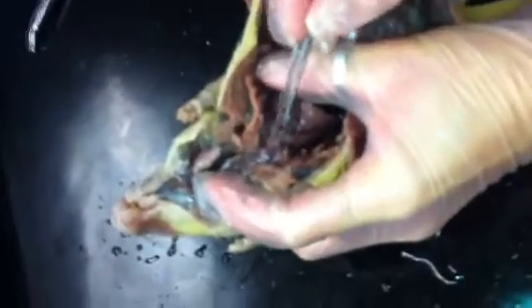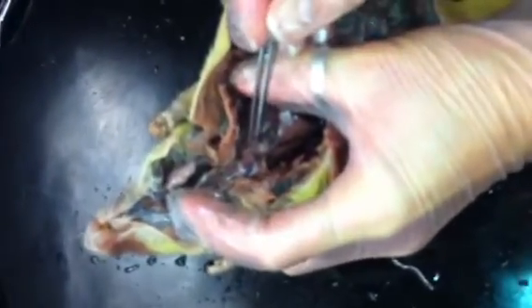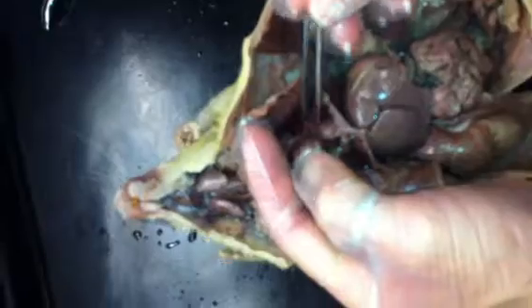Yeah, you can start to see, I just poked a hole in the trachea. But you can start to see that when I pull the trachea, there's another structure that's moving with it. That's the esophagus there. And this brownish mass right there is part of the thymus gland. And it sits just above the heart. And so that's the heart there. And then here's 1, 2, and 3 lobes of the right lung. And then to see the left lung, I need to pull the heart a little forward. And then there's one of the lobes of the left lung there.